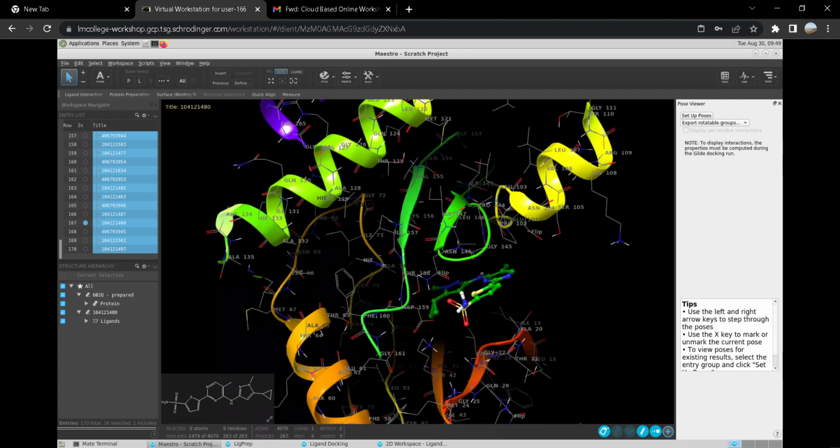I'm just refreshing it because the instance was too slow. I don't know what happened.